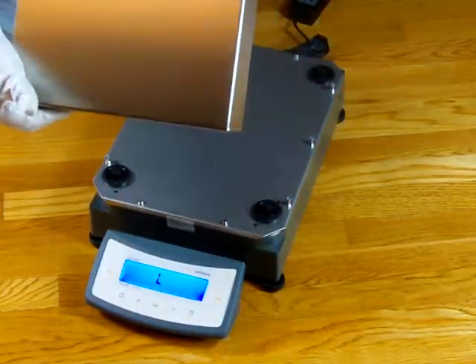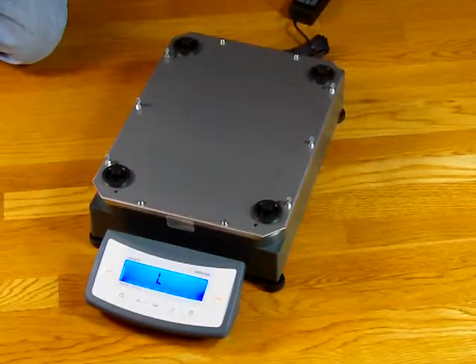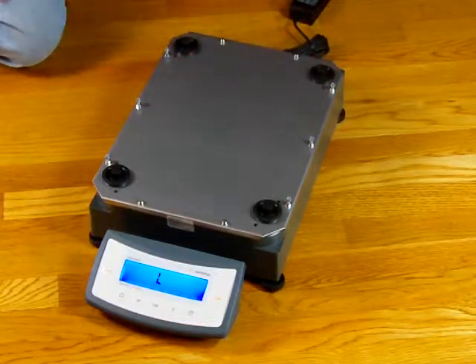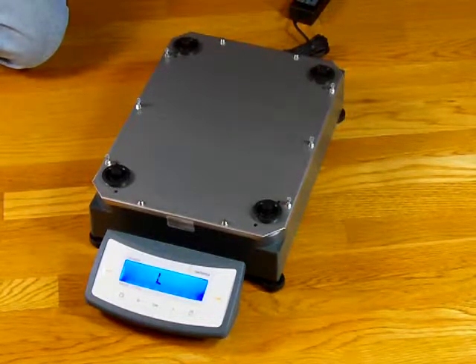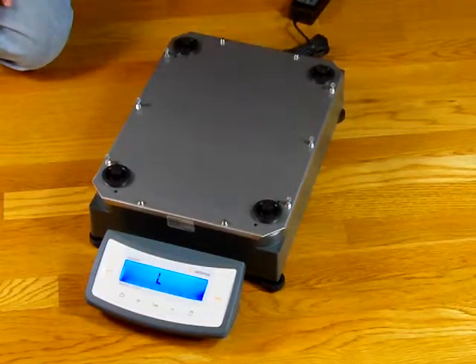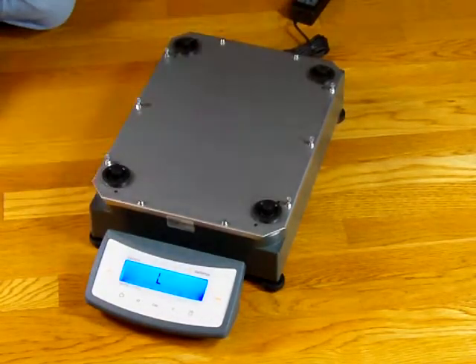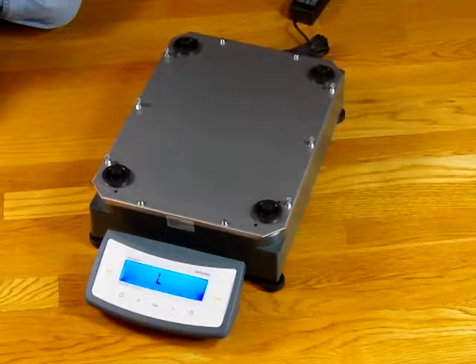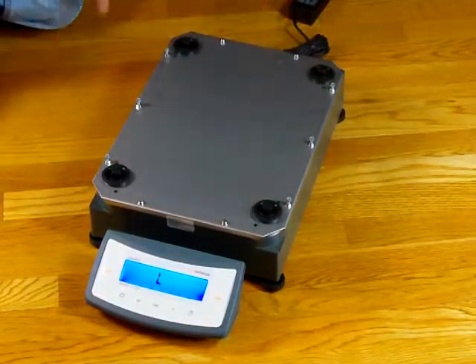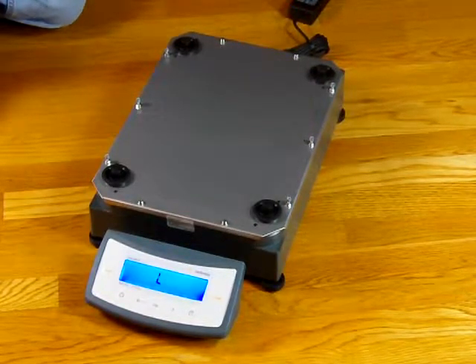The platform is removable — a nice large stainless steel platter. Beneath the scale you can see it is all sealed. This particular scale has a rating of IP53: the five means it's dust resistant and the three means it's protected against water sprays. So if you were to spray down the balance, it would survive without harm. You have four posts here that support the pan, and this unit can only be powered off of a direct AC adapter.